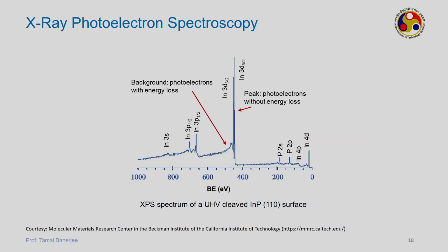So, you can back calculate and tell whether it is +1 oxidation state or say +2, +3 like that. So, this is an X-ray photoelectron spectroscopy for this particular sample. Now, you see these are the binding energies. What does this mean? It means that these are primary electrons which are scattered.